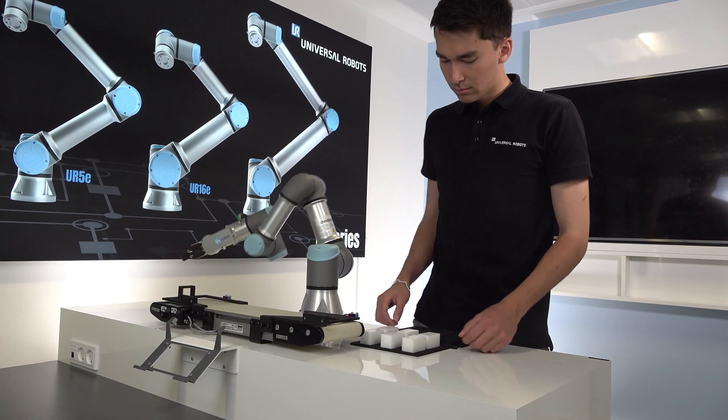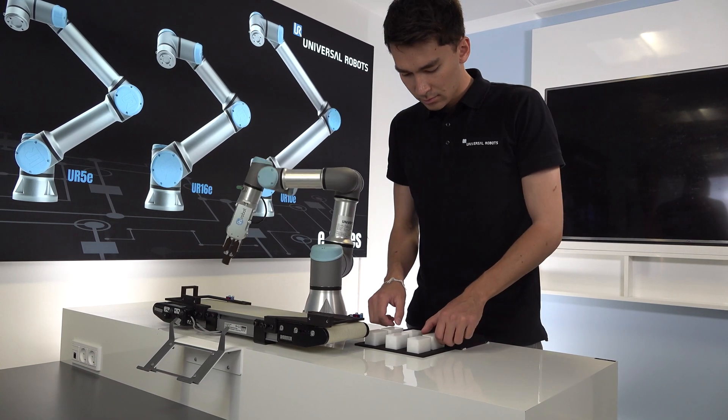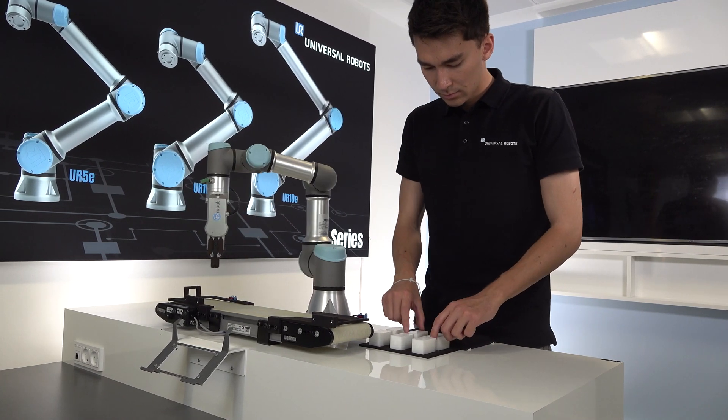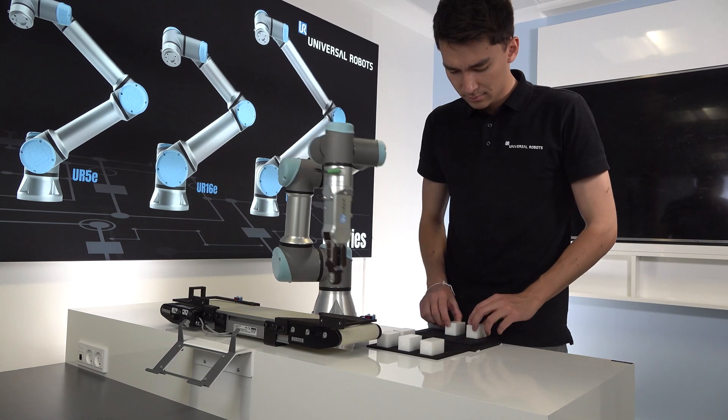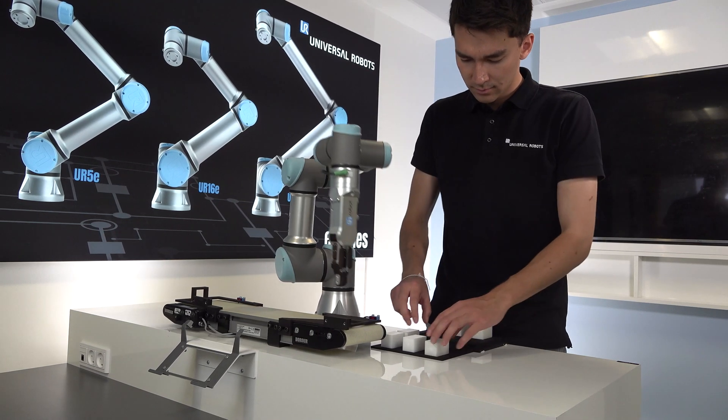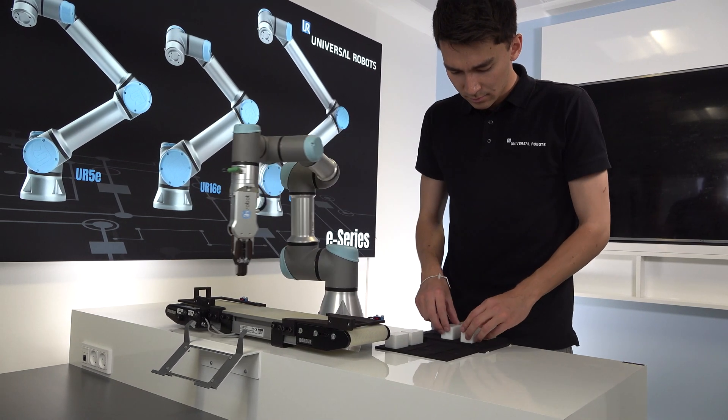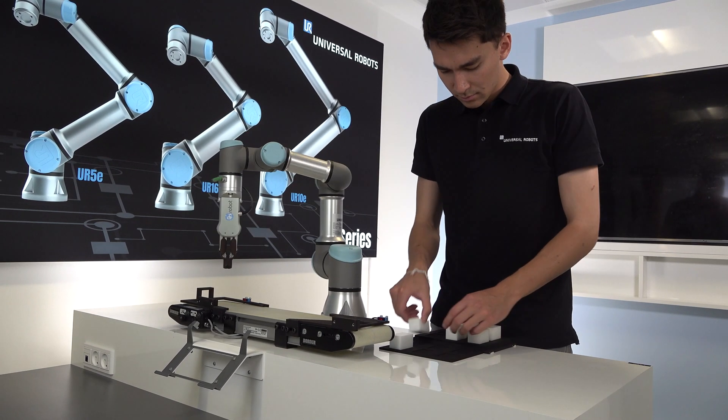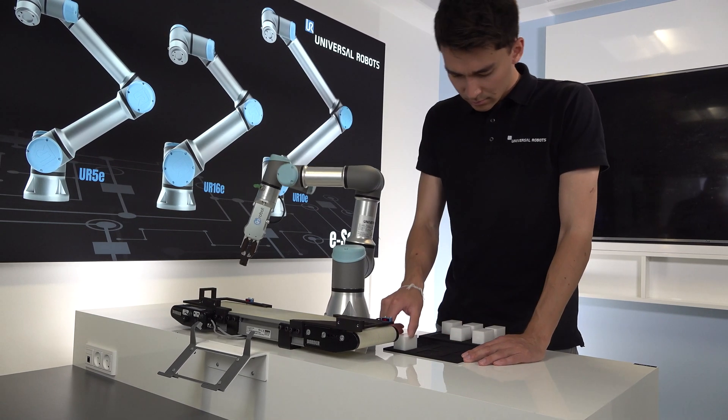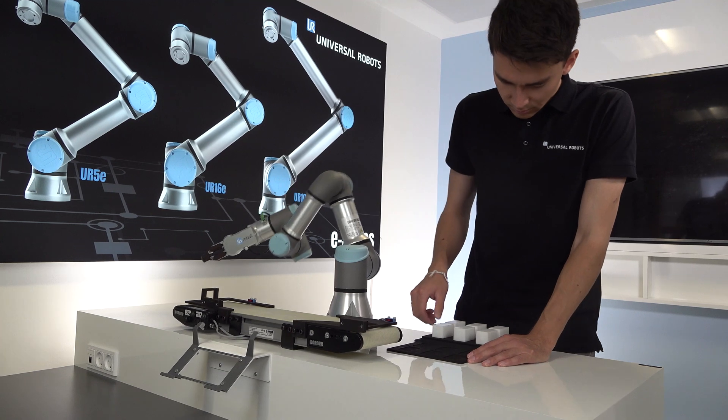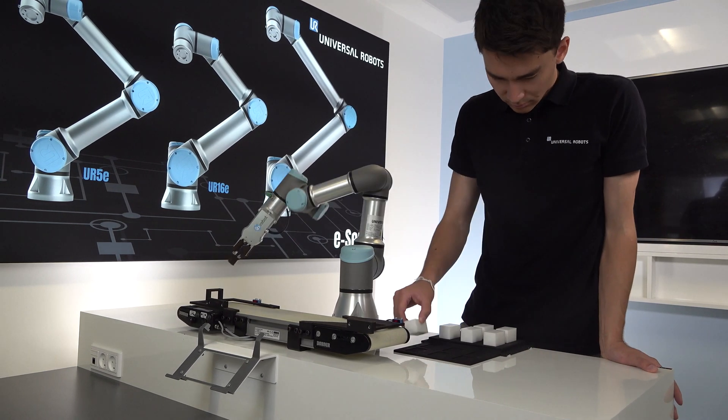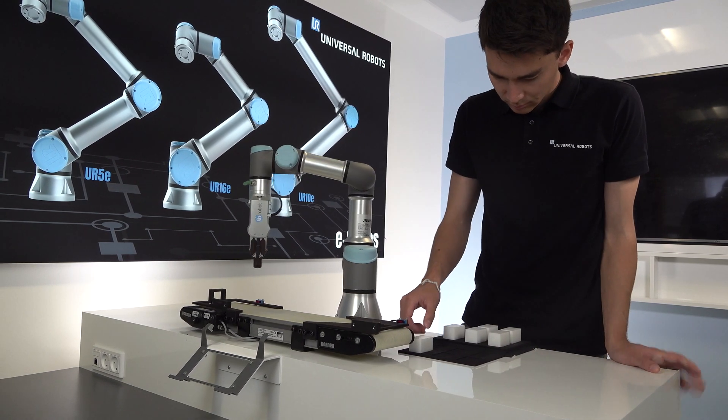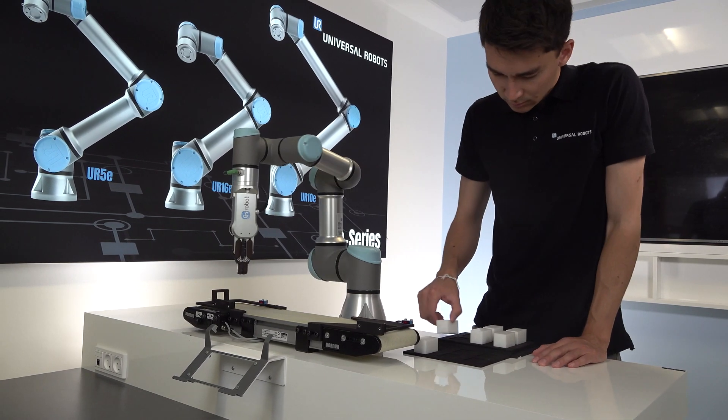One of UR's safety functions is the ability to set joint limits that restrict the movement of each individual joint. In this video, I'll show you how to use the joint limit functionality to create a safe workspace for the operator working next to the robot.